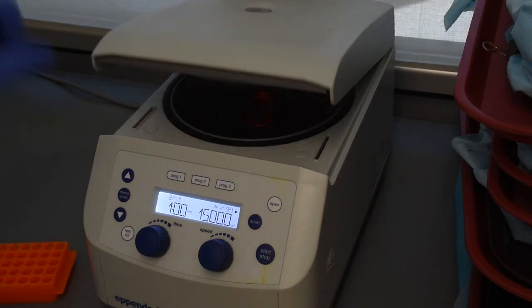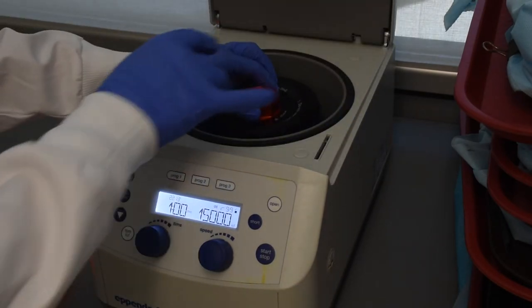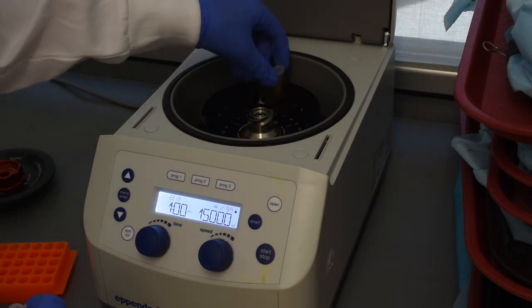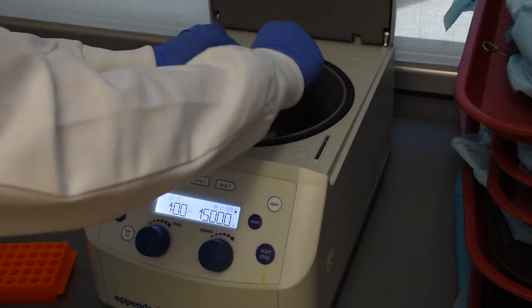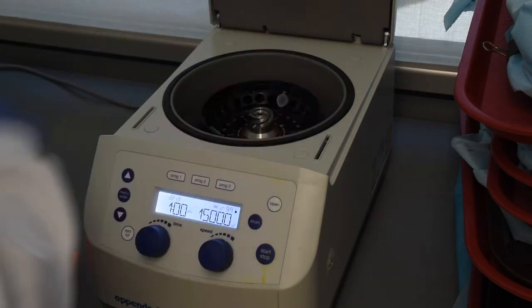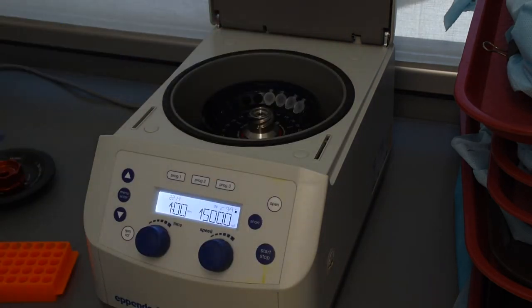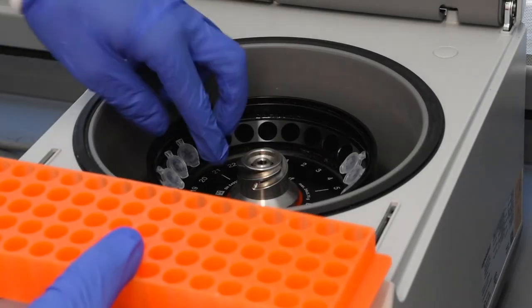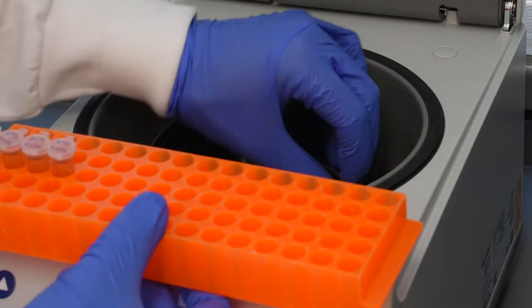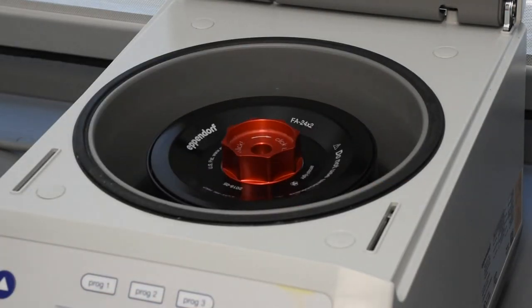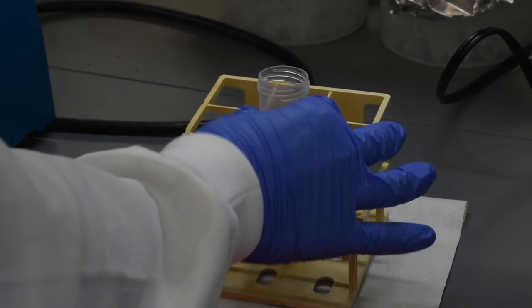Centrifuge your tubes at 15,000 times G for one minute. Pour off the supernatant, leaving a cell pellet.